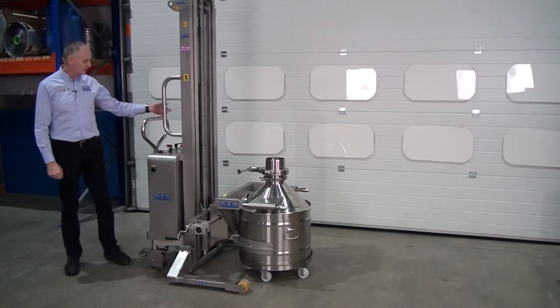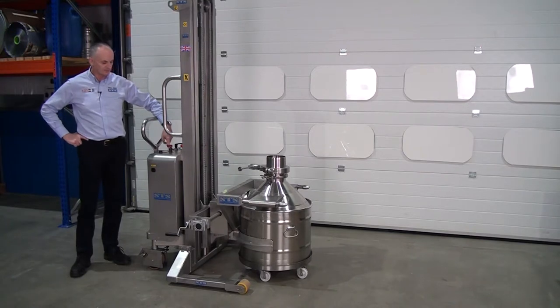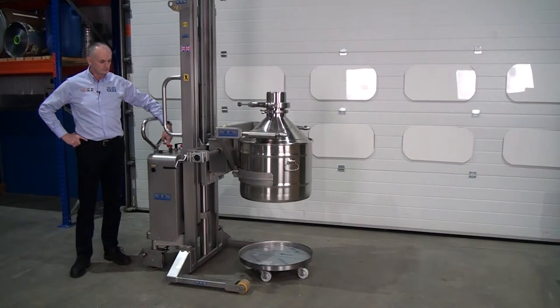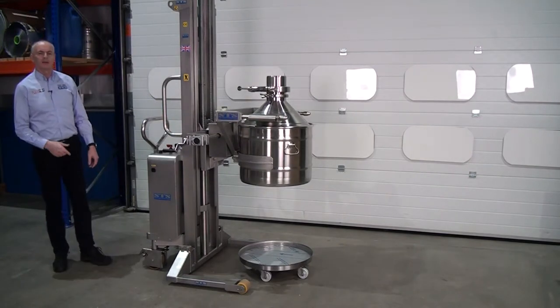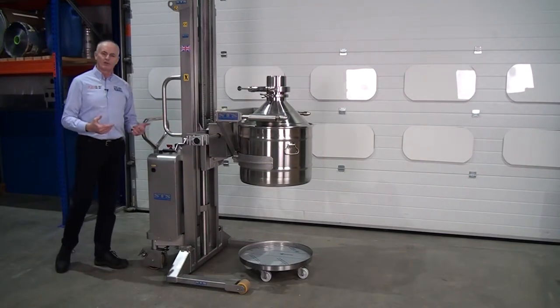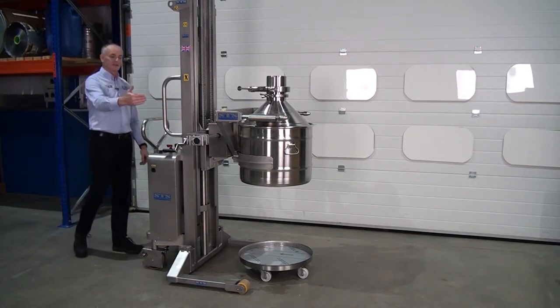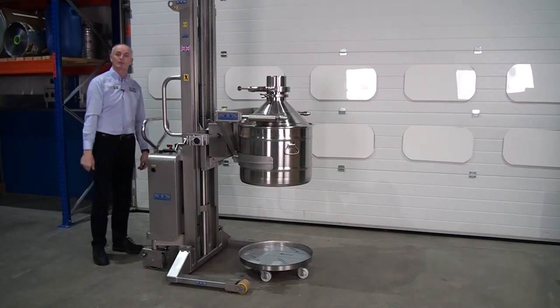Put the brake on, or one or two of the brakes on the unit, and then lift. Always remember when you're lifting or lowering, this is the safe area here behind. No one should be ahead of this position where any of the moving parts are.